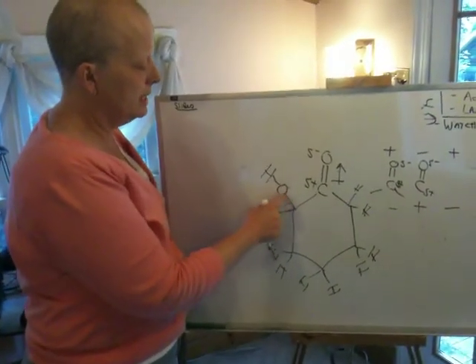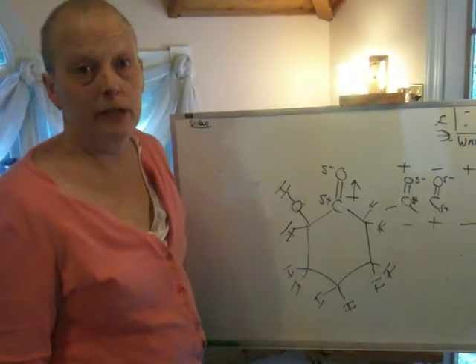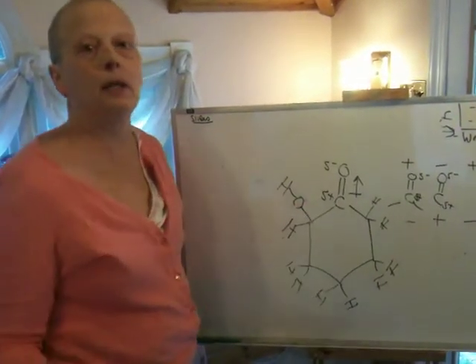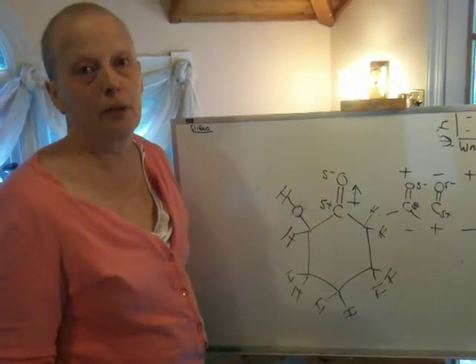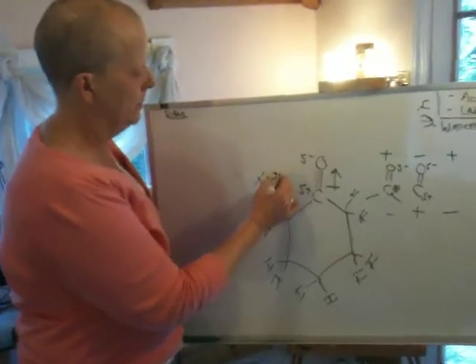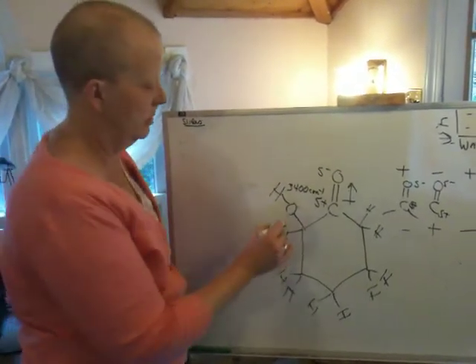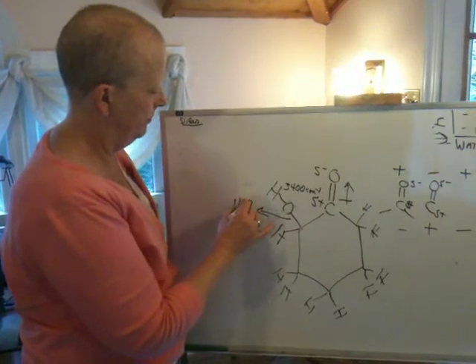We'd expect a CO absorption at around 1,100. That's just all I'm talking about right now, the stretching vibrations, not the bending. We would expect that. Now, would we pick up on that? Maybe, but realize it's buried in the fingerprint part of the spectrum. So this again, you would expect it to be around 3,400. There are some hydrogen bonding issues, but we're not going to go over them right now. We will get to them. This would be at about 1,100.